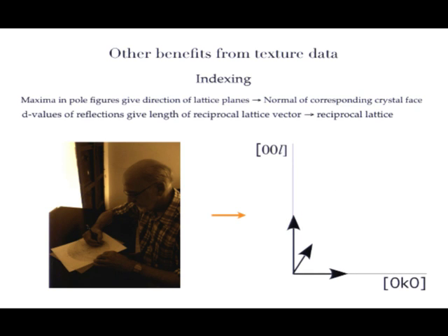We took the angle for a reflection and the length, plotted it on a piece of paper, and then you can find out what the reciprocal lattice is, and you can index these reflections as shown here. So you can do some old crystallography, and Lynn is going to talk about old ideas. This is an old idea with new opportunities, indexing a crystal using texture analysis.